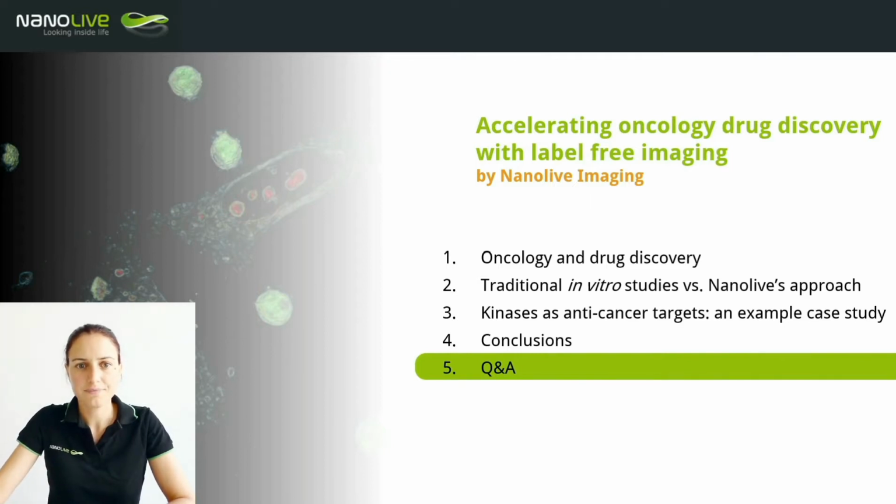Second question. You mentioned the negative effects of fluorescence. Have you tested for this? So yes, one of my colleagues, Hugo, did his master's thesis on exactly this topic. He compared the possible phototoxic effects that were induced by Nanolive imaging with those that were induced by epifluorescence imaging, and found substantial differences between the two. He found that mitochondria were particularly sensitive to phototoxicity. So if you're interested in reading Hugo's master's thesis, it is available to download on our website. So I encourage you to do that. It's a really well done study.